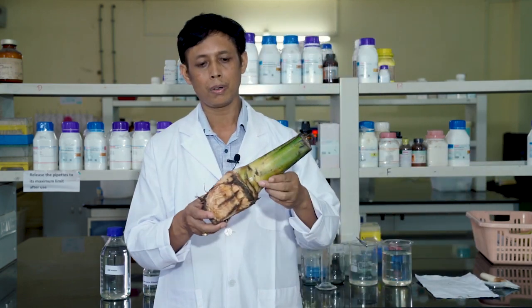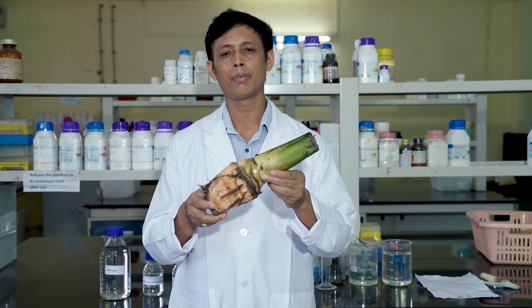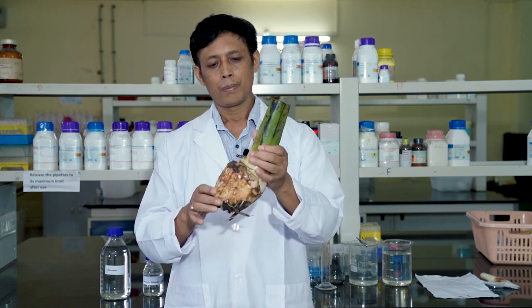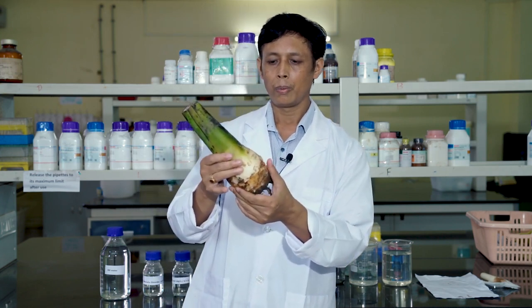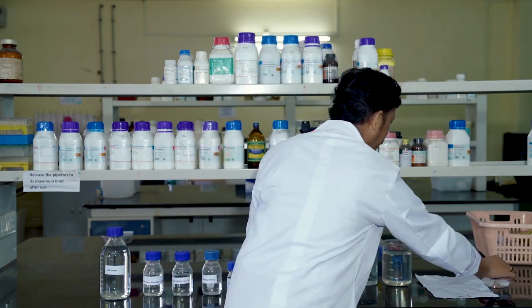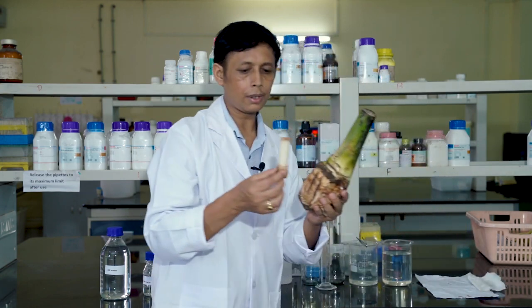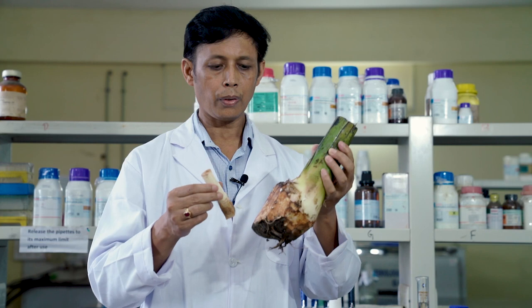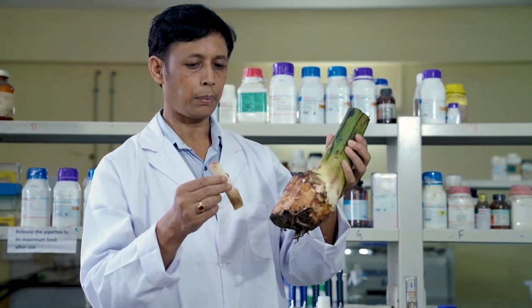This is one of the sword suckers which I have collected for this practical. From this sword sucker, we will extract the shoot apical meristem. I have already extracted the shoot apical meristem, as you can see here. So this is the shoot apical meristem extracted from the sword sucker. Here you can see the explant that I have collected.